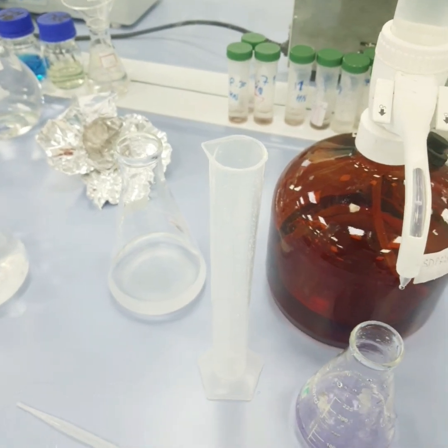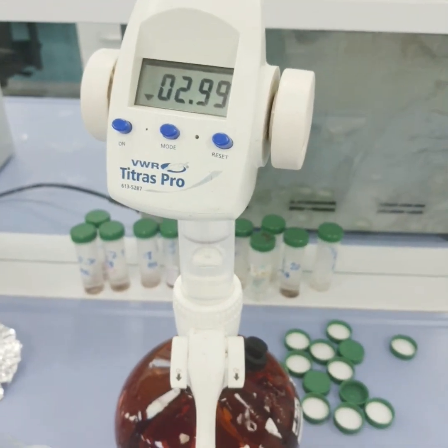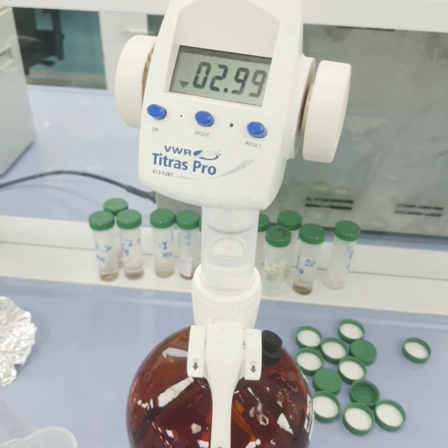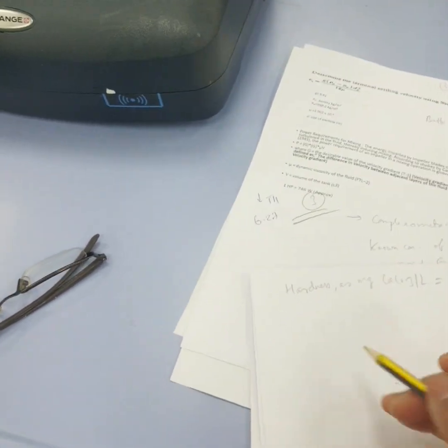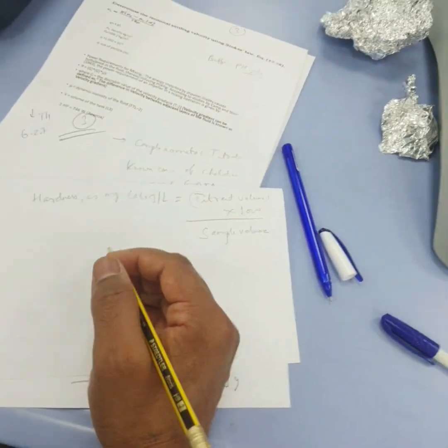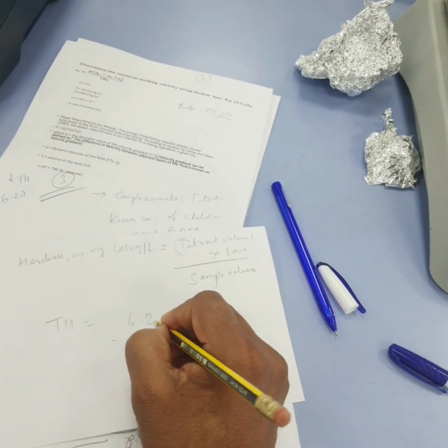So you can see in a few drops only the color has changed. It consumes around 3 ml, which is almost half of the sample before boiling.